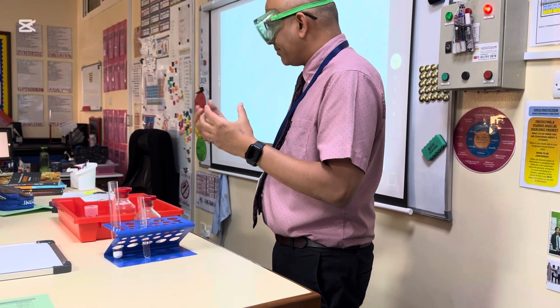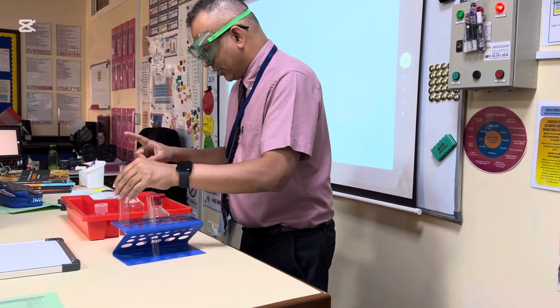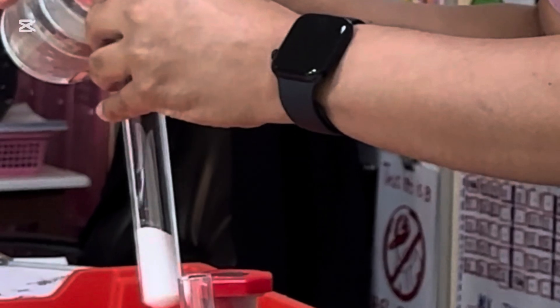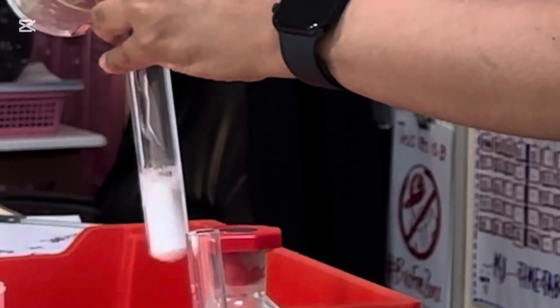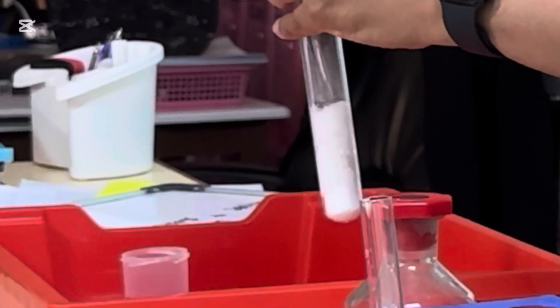Right. So what I've now got to do is I've got to add the sulfuric acid. Let's pour it. This is the sulfuric acid. And you can already see some bubbling taking place, which is a great sign.